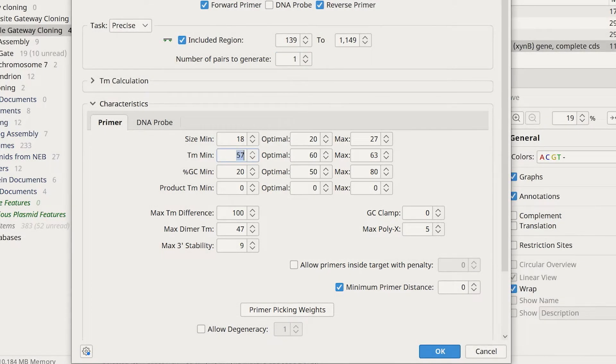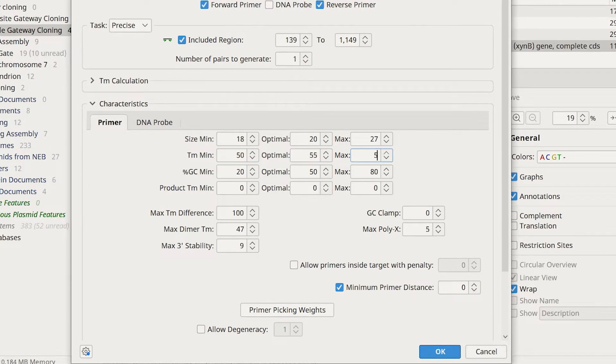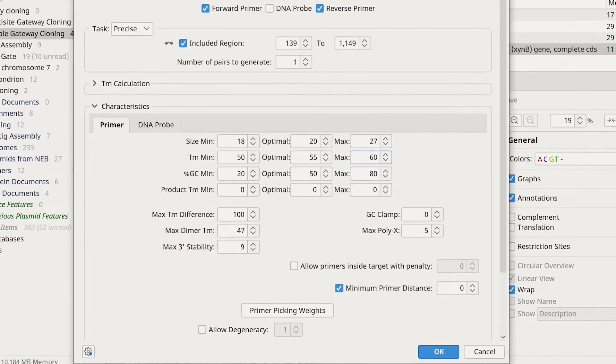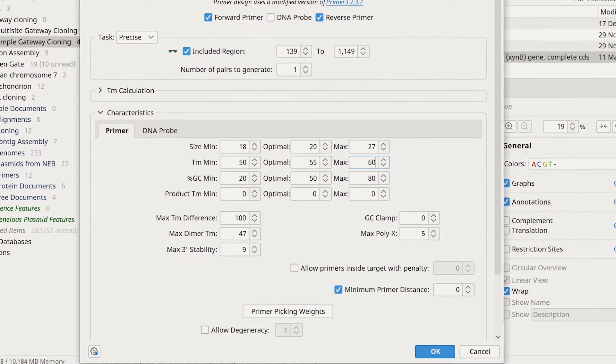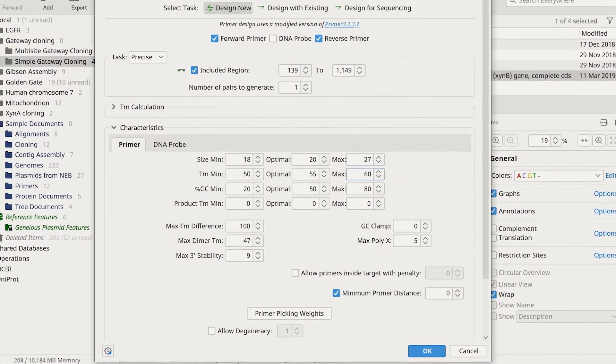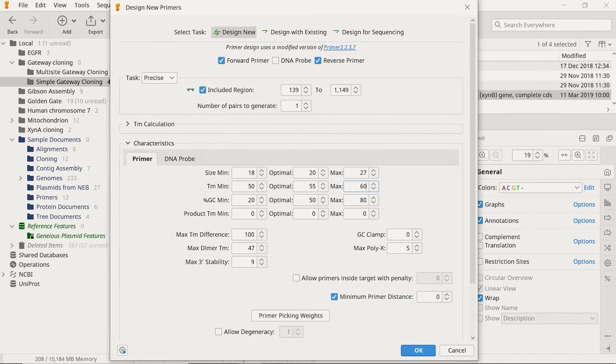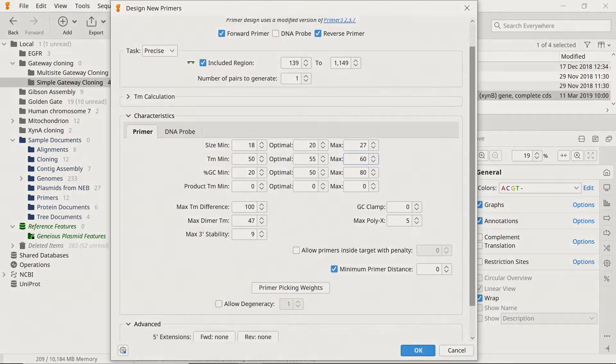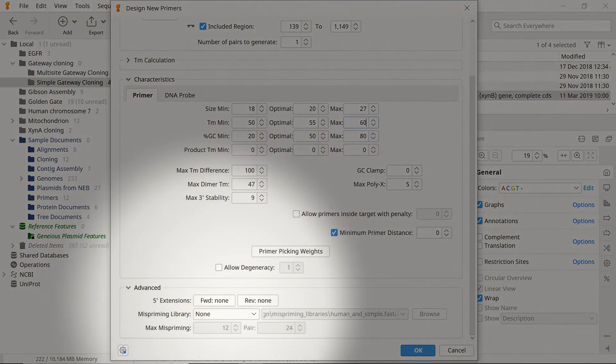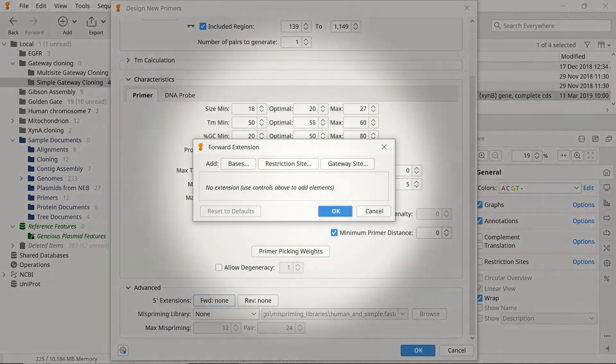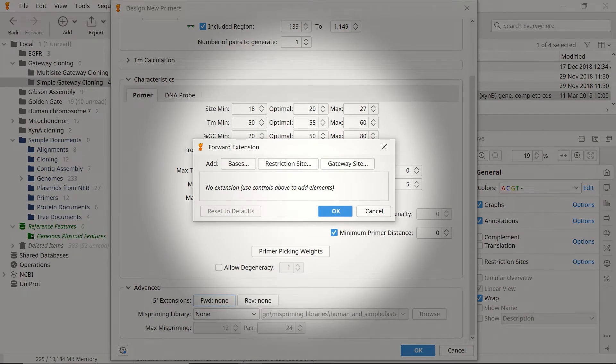To adjust a setting, simply enter your desired values into the boxes. Lastly, since these primers are for gateway cloning BP reaction, you need to add the appropriate five prime extensions. To add five prime extensions, select the Advanced option. Then select the Forward button to edit the Forward Primer extension in the pop-up window.